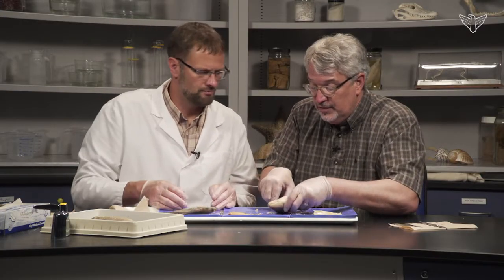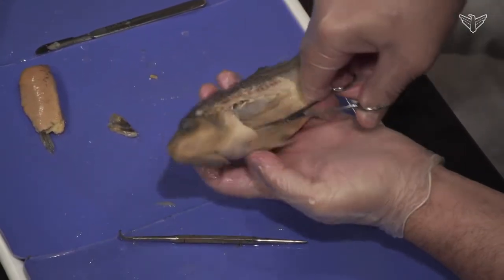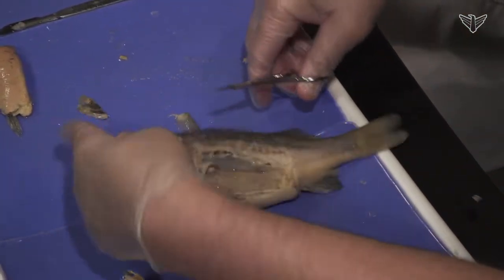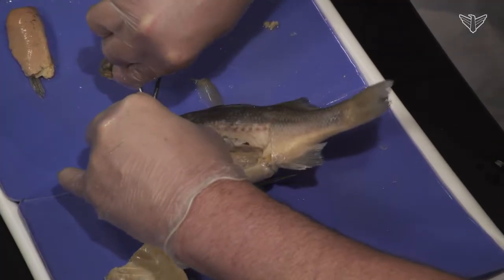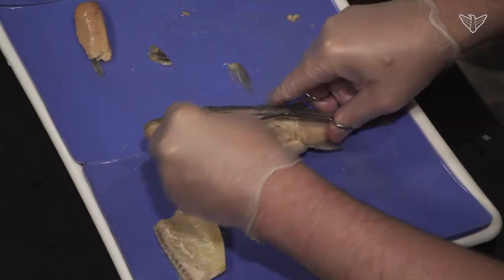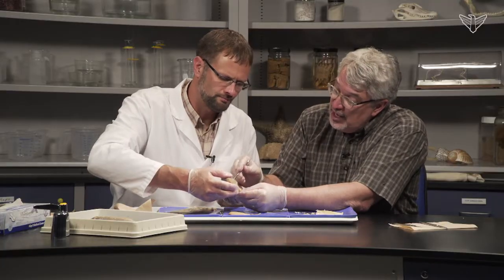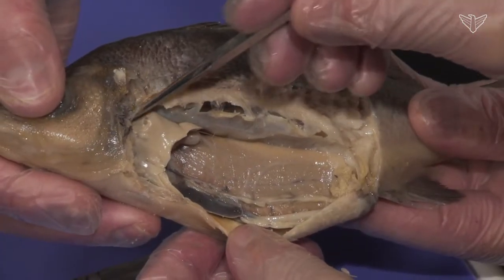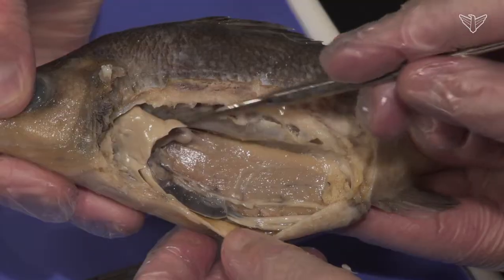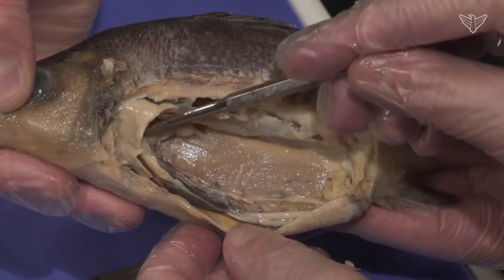We'll cut a little of the operculum off. There's some thicker bone there — another reason I use scissors rather than a scalpel. Now you can see the swim bladder, and this large structure up at the anterior part of the cavity is the liver. In most vertebrates, livers are very large structures — here's almost all of this white material, that's the liver.